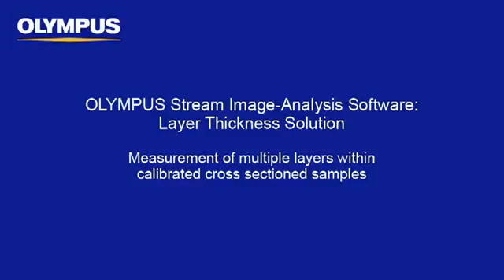This tutorial video will provide you with detailed instructions to perform layer thickness measurements on cross-section samples within the Olympus Stream Image Analysis software. The layer thickness solution is an add-in module for Stream Essentials and above.